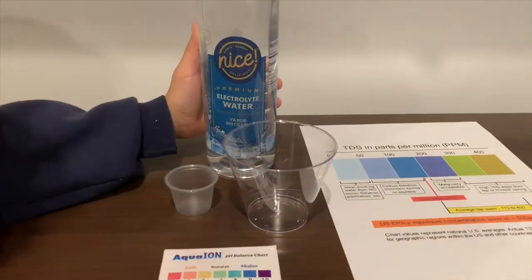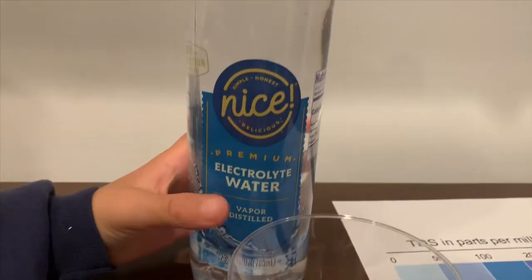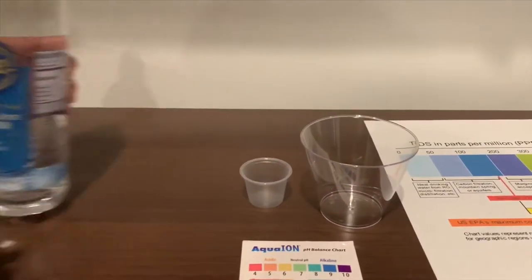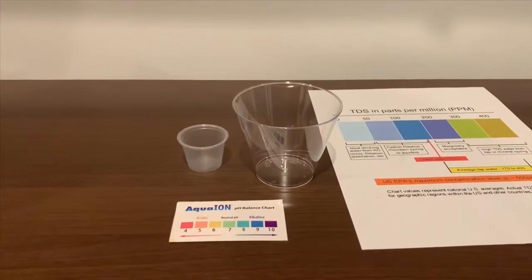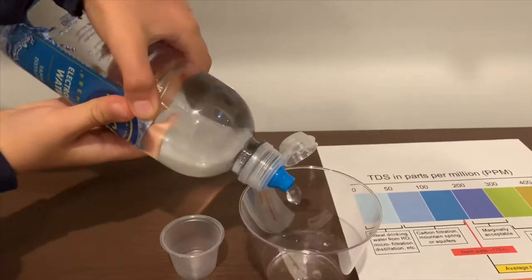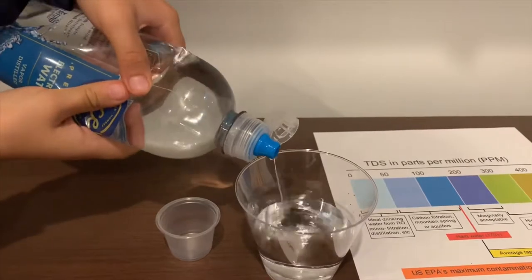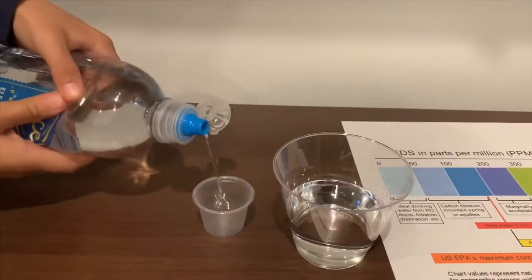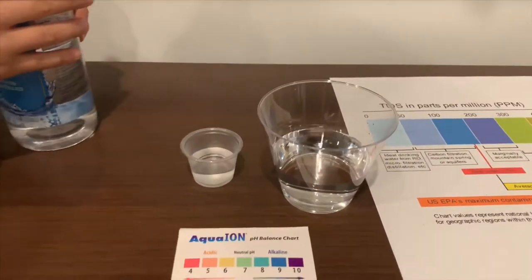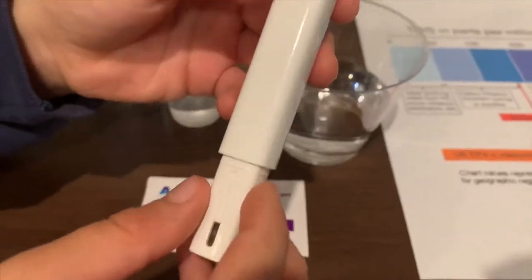This is a nice electrolyte water — it is vapor distilled and costs 99 cents. Let's test the TDS and pH. Let's pour some water in first. We're going to test the TDS; if you want to buy this TDS tester, the link is down below.